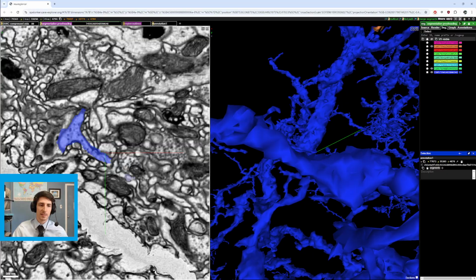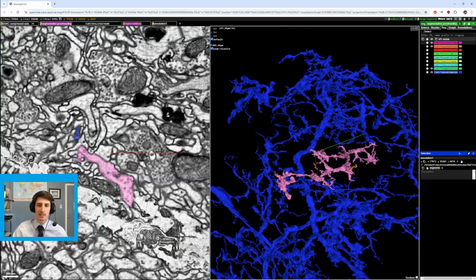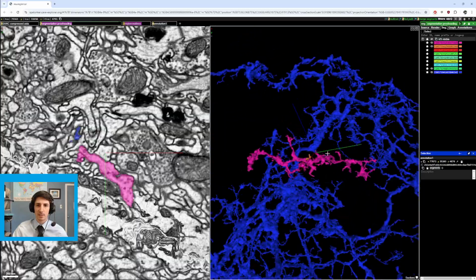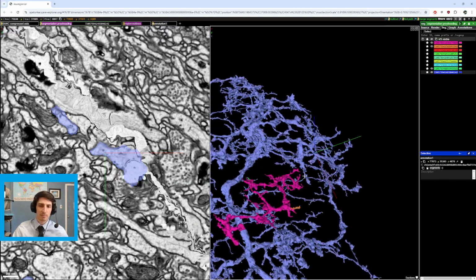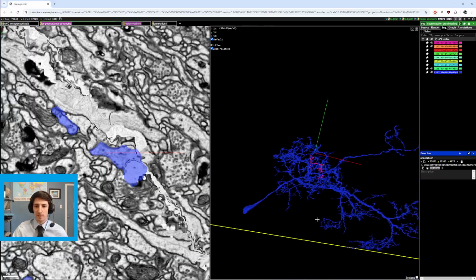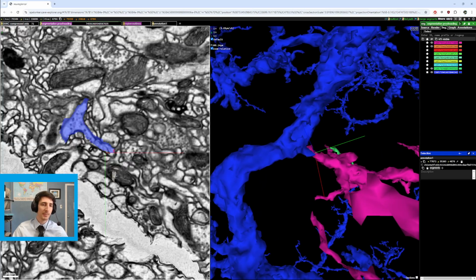And as we've discussed in some of those other videos, that is typically where a branch is going to be. The overall structure of this branch is very similar to the structure of these other branches, very lumpy, stocky, short, nubby branches. And it generally fits the morphology of the cell. The connection is very clear.